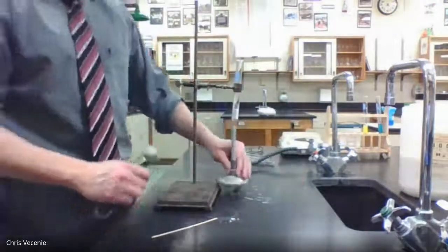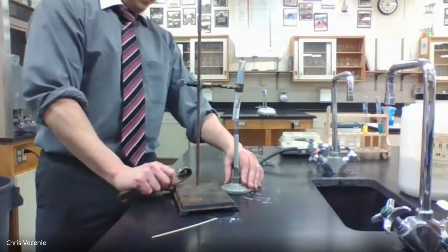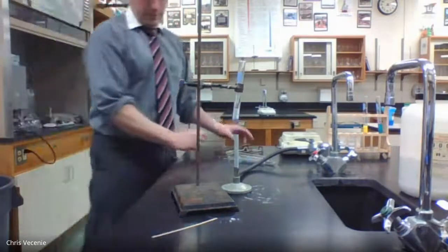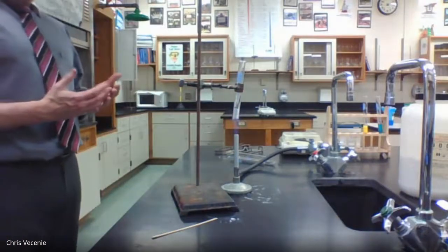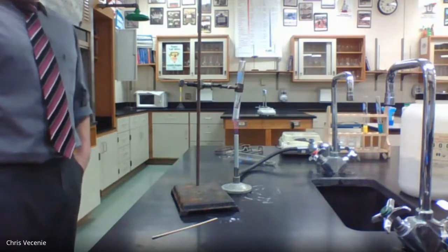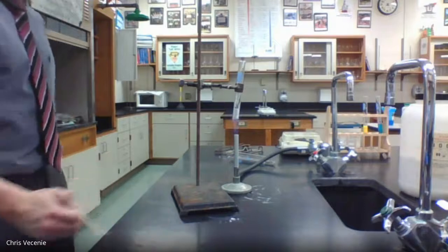Okay, my burner's going. All right, we're going to heat that, and you want to keep an eye on it because every once in a while, if you produce a gas, for instance, underneath that solid and it can't escape, it's going to want to push that solid up out. So we want to make sure that that doesn't happen.